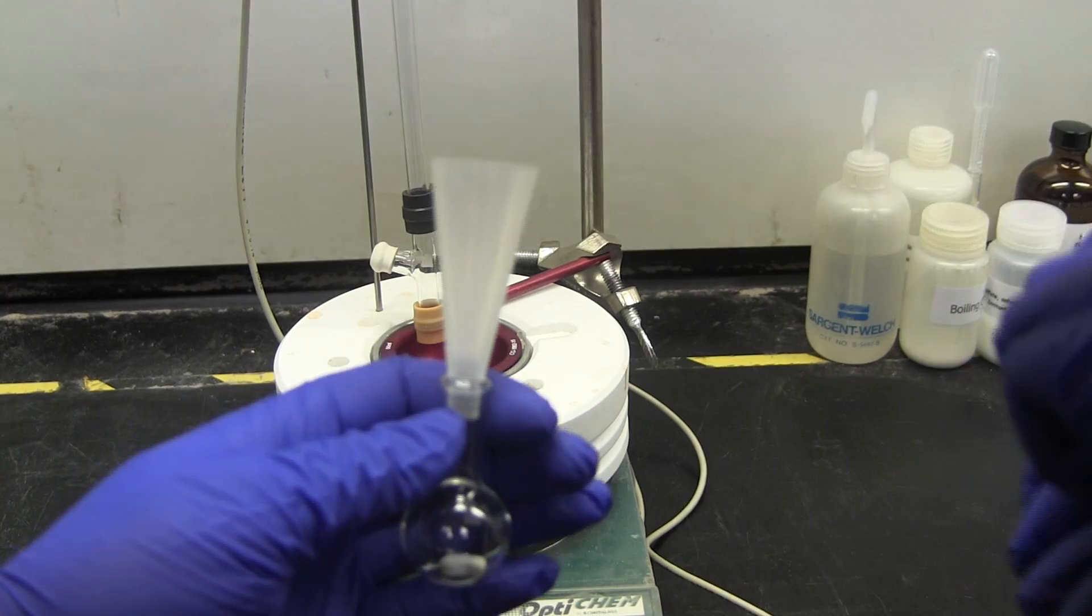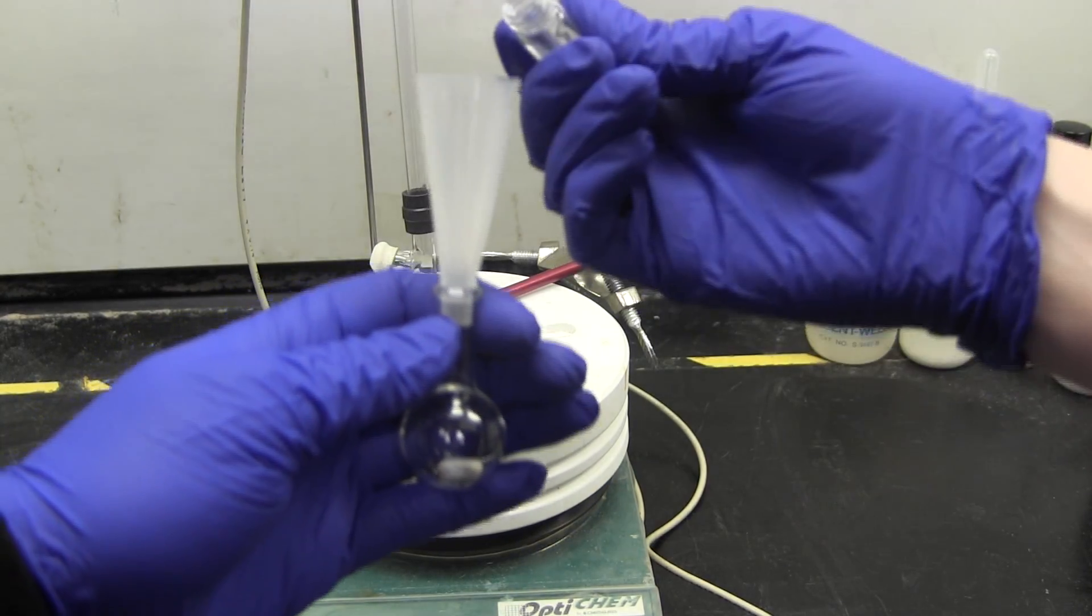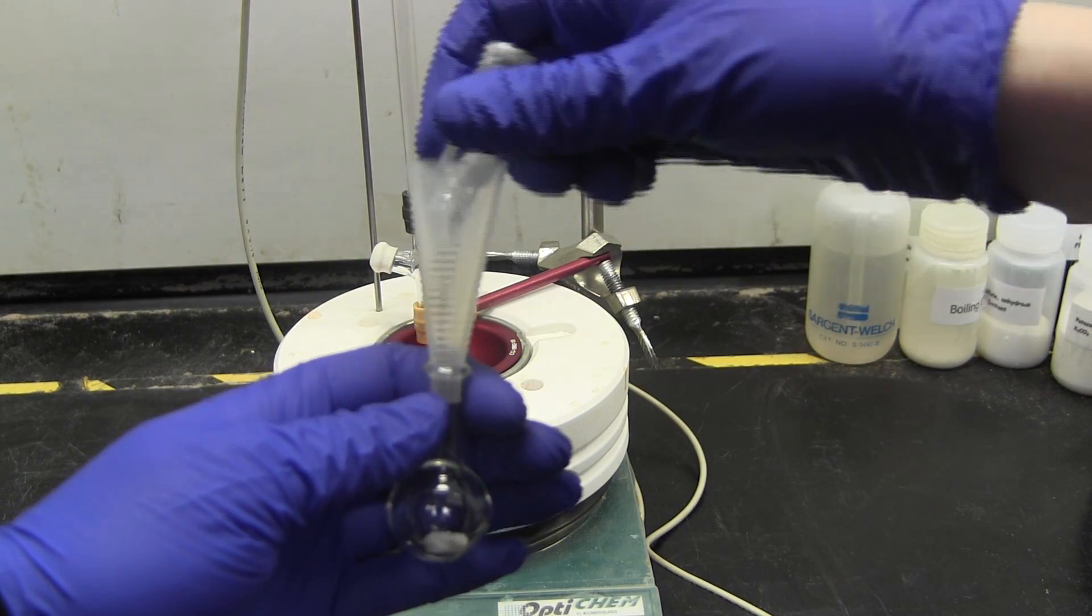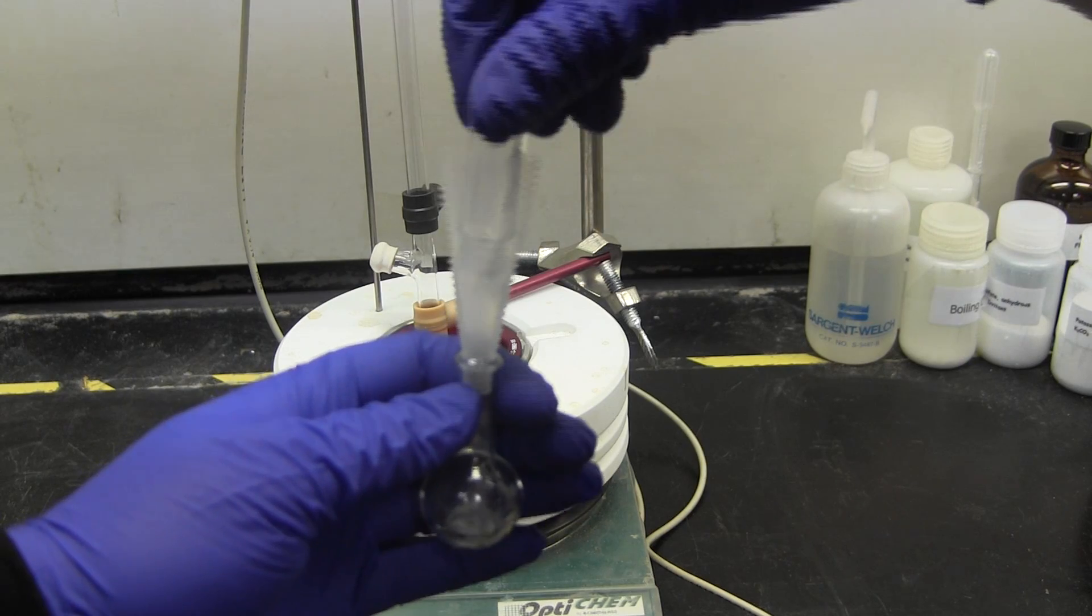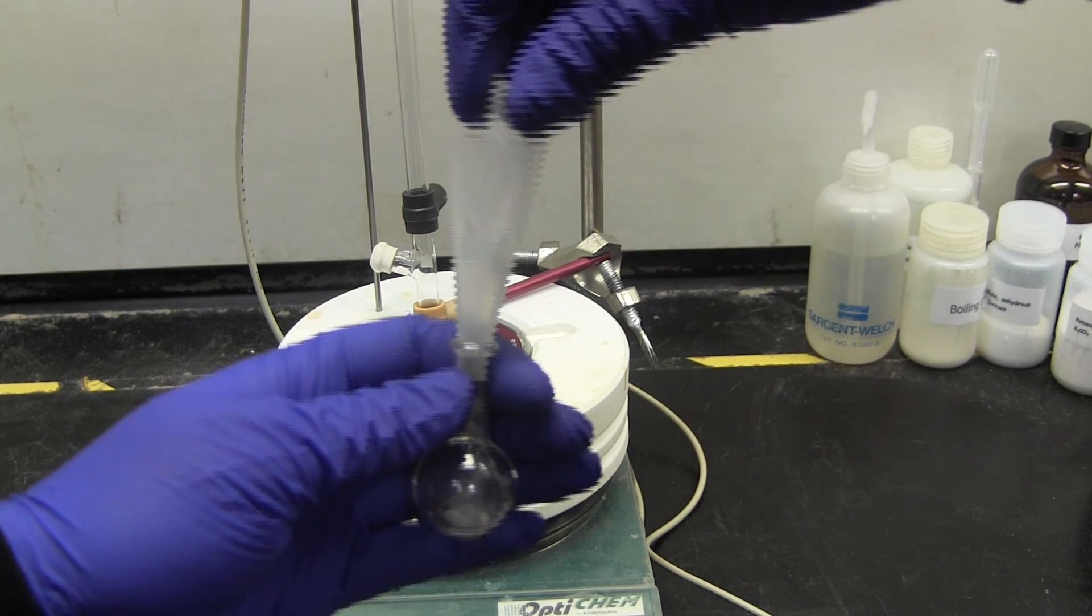The LAH in your vial is pre-weighed, so you do not have to measure it out. Simply add it to your flask through a small chromatography funnel. Weigh the vial before and after addition and record the exact amount of LAH added.